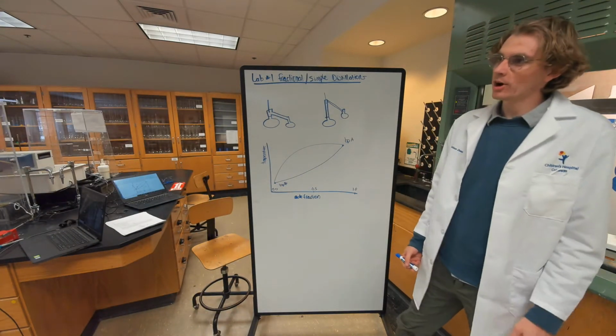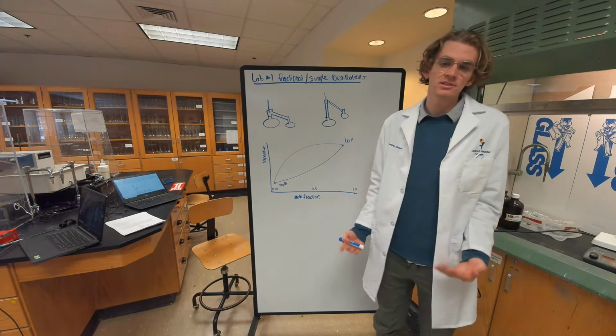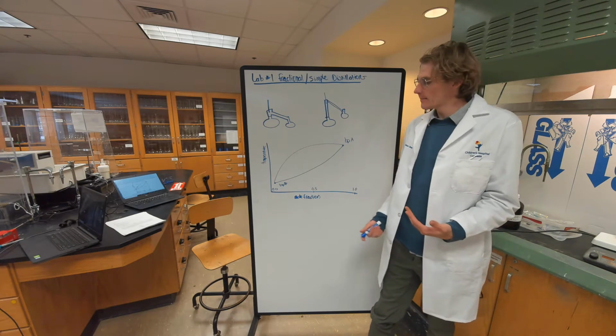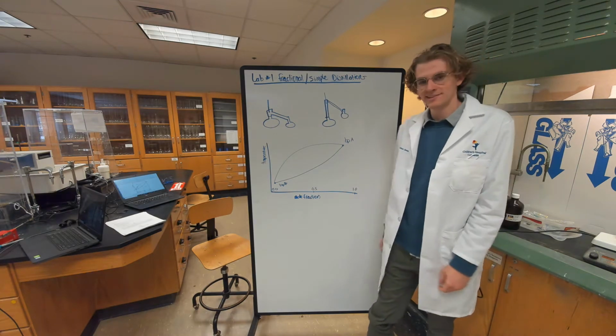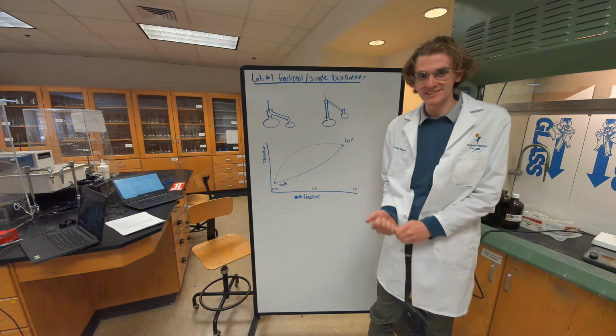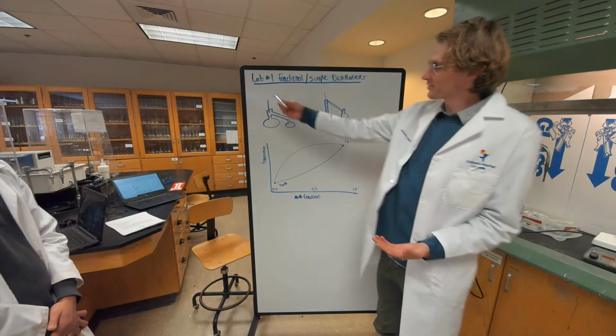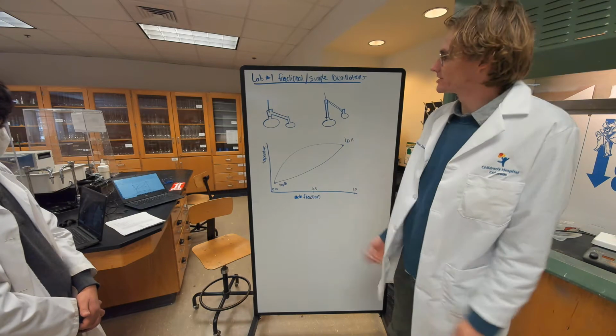During the course of this quarter, we hope to not only instill you with a deep, almost overwhelming love for chemistry, but hopefully we'll actually perform the labs correctly too. And that's our horrible segue into our first lab, fractional and simple distillations.